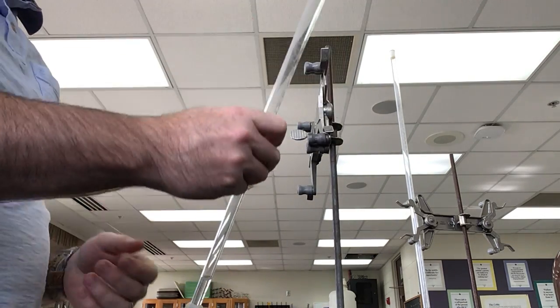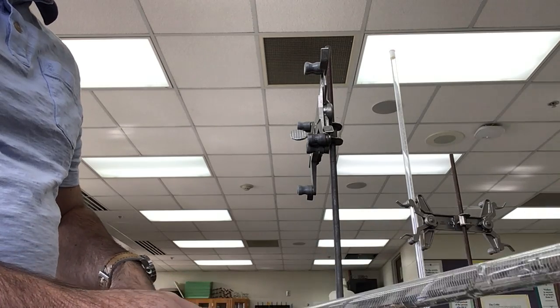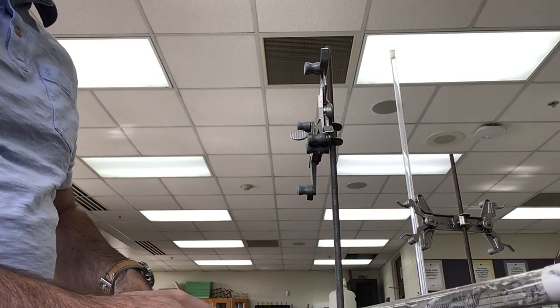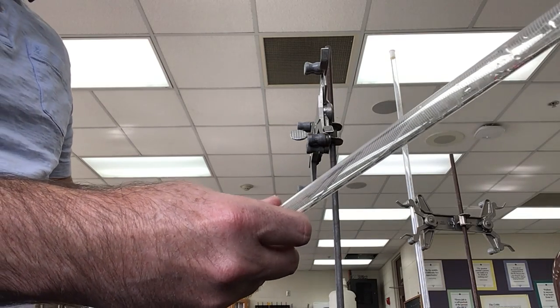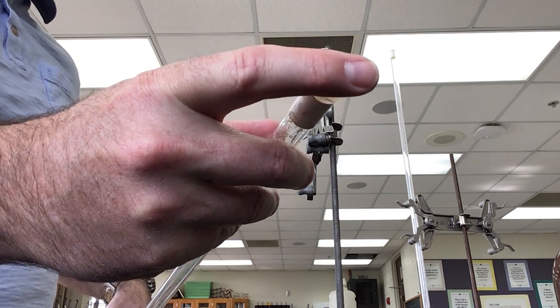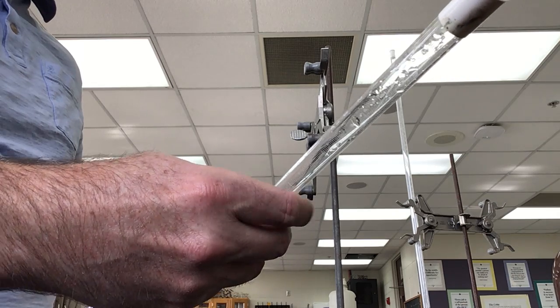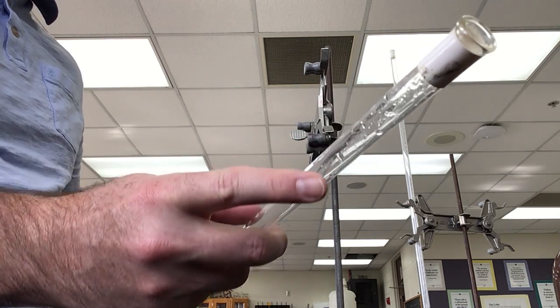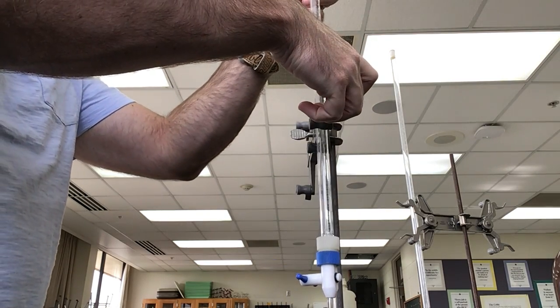So again, I'm just going to turn this to the side, kind of roll this around, get the liquid down as far as I can in here, kind of rolling this around. I wouldn't ever want to put my finger over this. That wouldn't be a good lab practice. As you empty it out, you can kind of roll it as well, so you can get some of the liquid up here and kind of mix there. All right, so kind of shake that out, go ahead and put it back, and I'd maybe do that one more time.